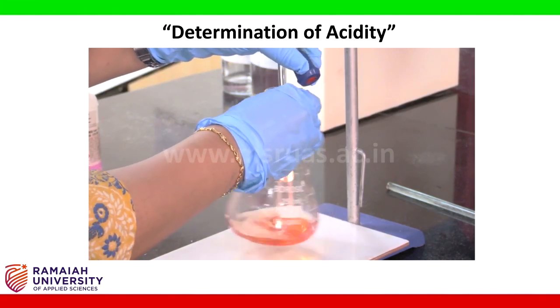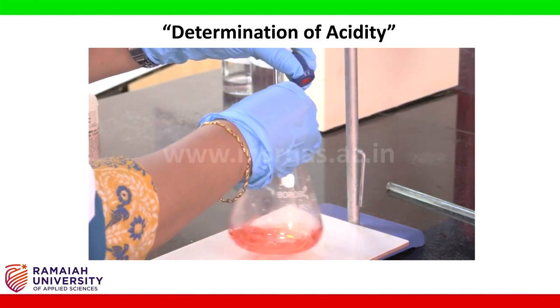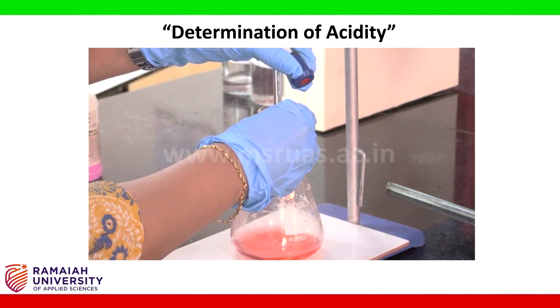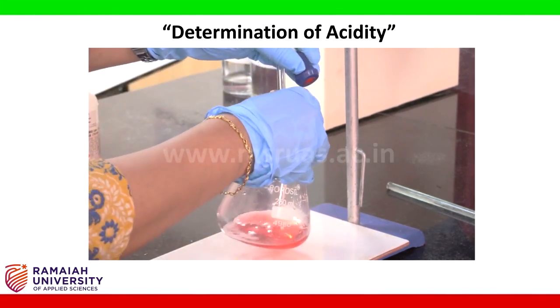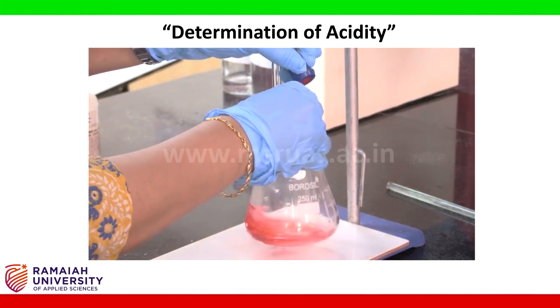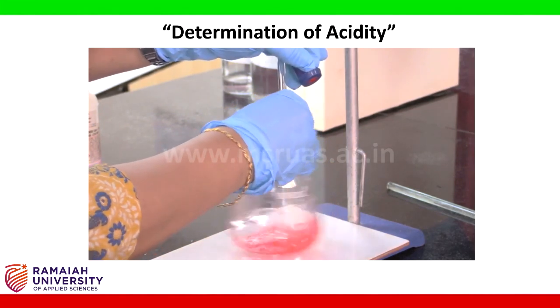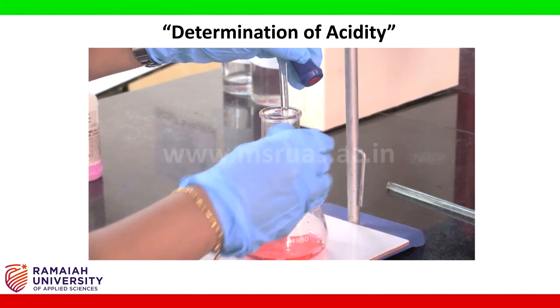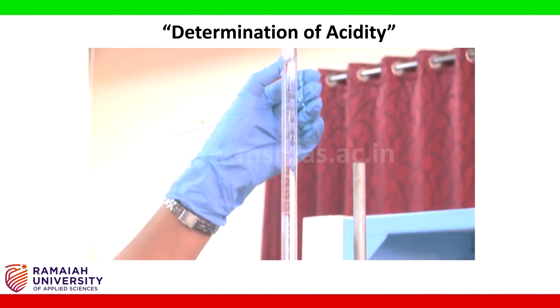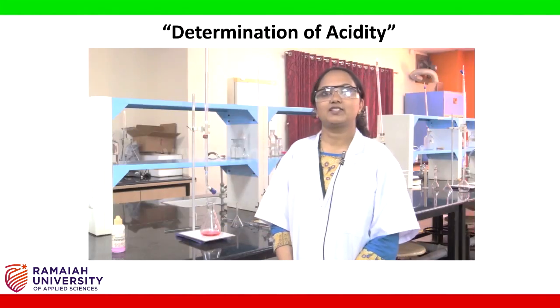Now the color has changed. You can see the color change, that is it has turned to pink. Note down the reading from the burette. So this completes the experiment of acidity.